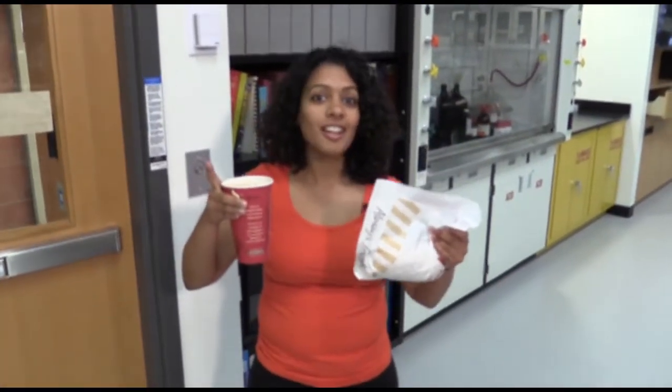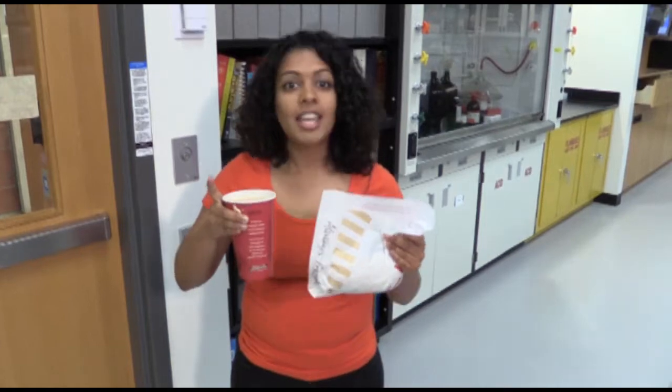So, food and drink, not allowed in the lab. Keep it outside, enjoy it after your lab.